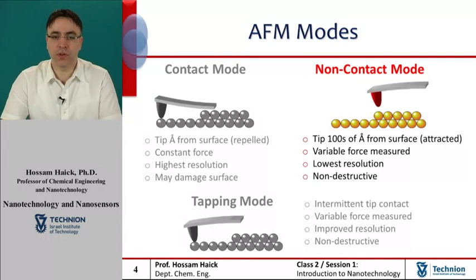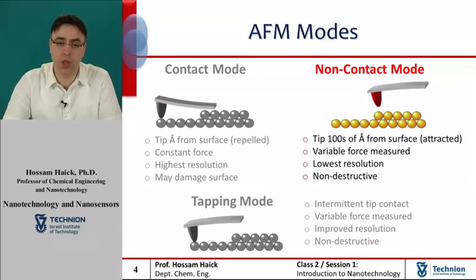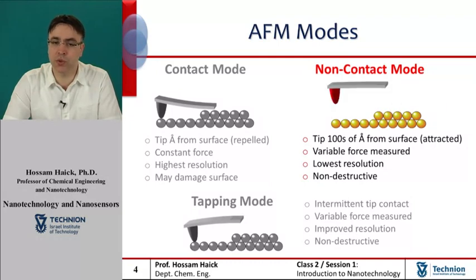The van der Waals forces, which are strongest from 1 nanometer to 10 nanometers above the surface, or any other long-range forces which extend above the surface, act to decrease the resonance frequency of the cantilever.